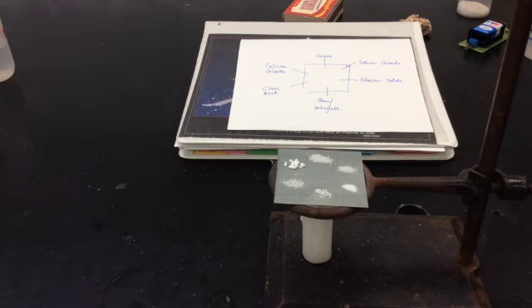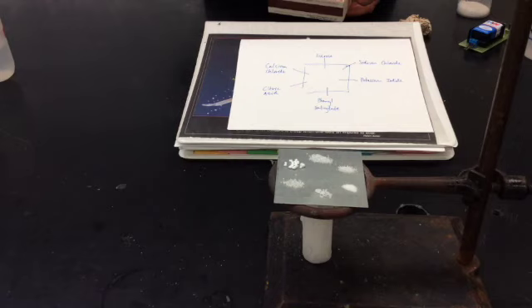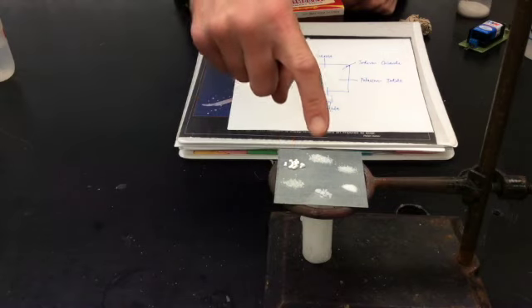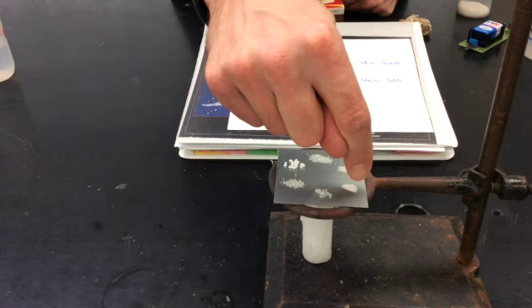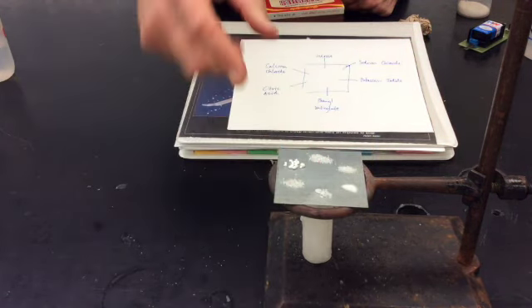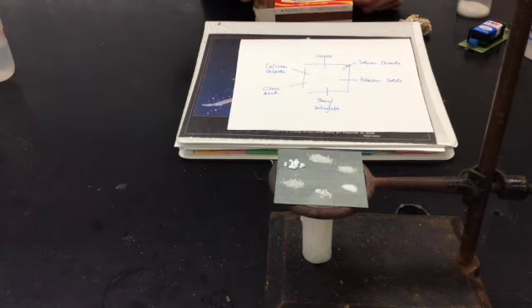Calcium chloride is deliquescent, which means it absorbs moisture from the atmosphere, and so the calcium chloride clumps look just a little bit shiny. That's these guys right here. This is sucrose, this is sodium chloride, this is potassium iodide, here's the phenyl salicylate, and this is the citric acid. You can see them displayed here on this page as well.